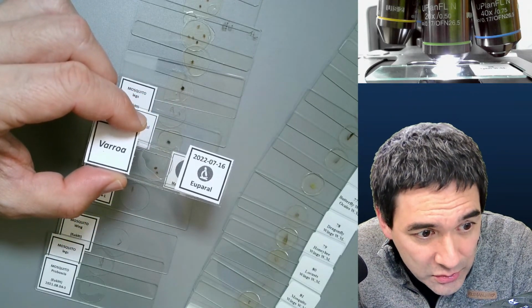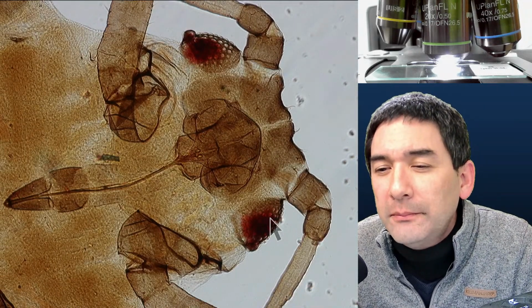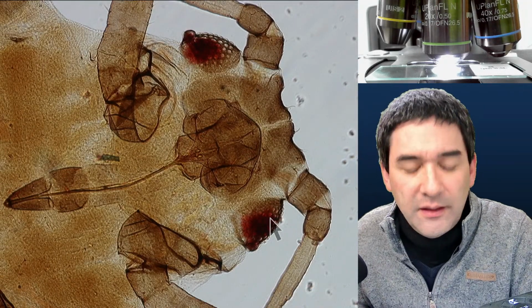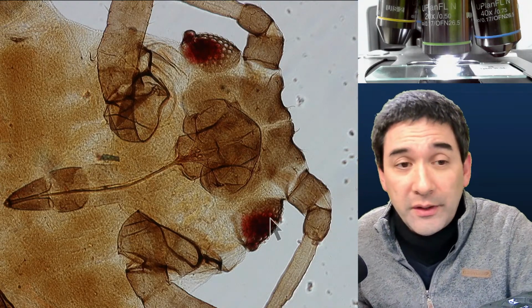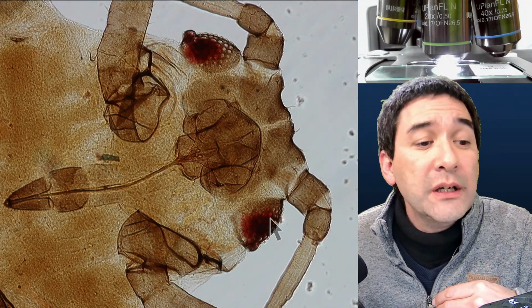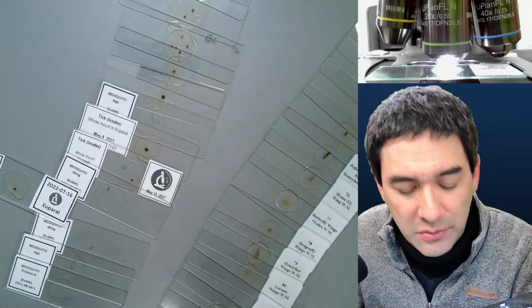But what I'm going to do is go back again here. Okay. So this is kind of the thing here. And what I'm going to do now, after the aphid, is work myself through all of the slides that I have over here. And then we're going to see how far I'm able to go.